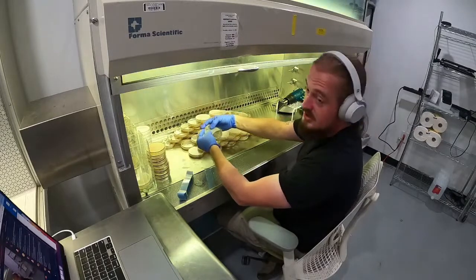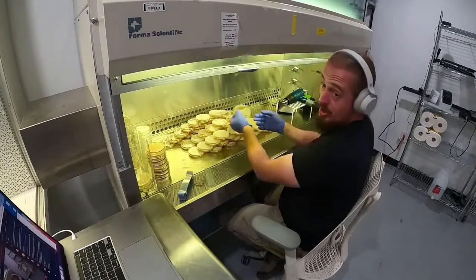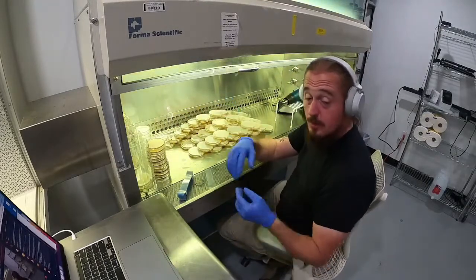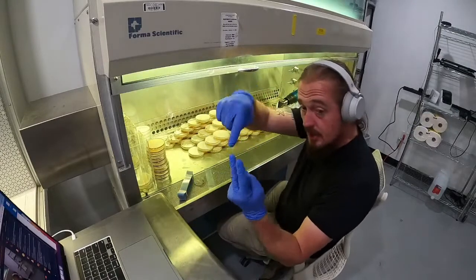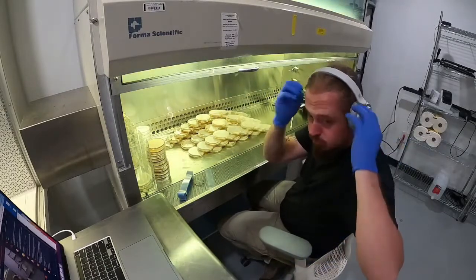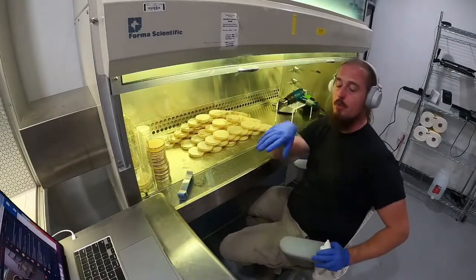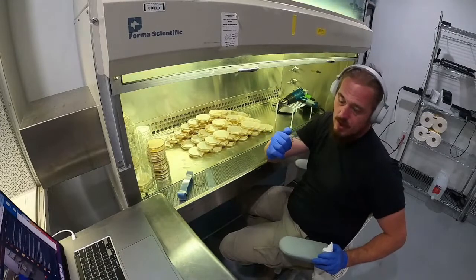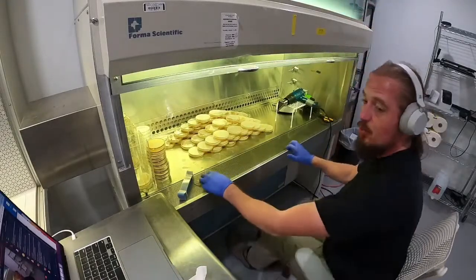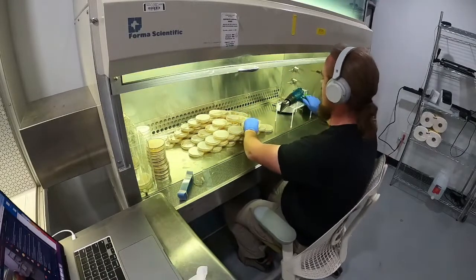This is why I never inject spores to grain. Whenever I get spores, I always put them on an agar dish, because that way I can select breeding pairs. If you take two spores, they mate, you get one fungus, but that one fungus could have 16 different genetic lines contained within it. But because you're using multiple spores and those spores are inert, when you inject that into the grain, now it's a race. When you're growing mushrooms, you have to think of it as a race. You are trying to grow the fungus that you want faster than all other fungi and bacteria in that space.